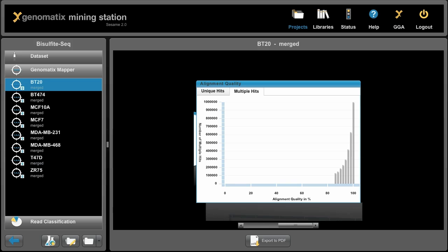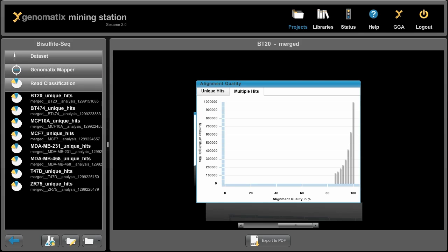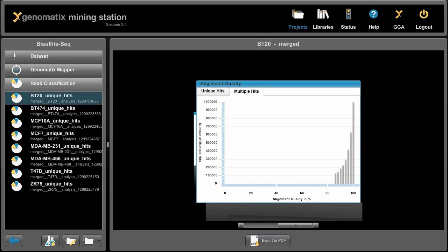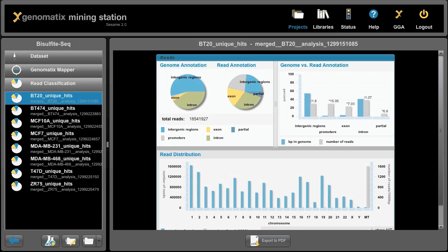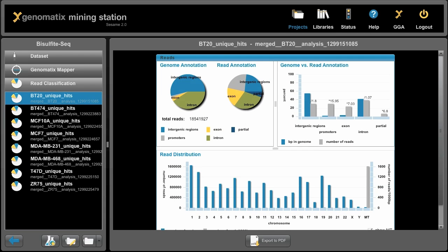We can also do quality control or read classification. For example, we can look at what genomic regions are enriched within the mapped reads. And in this case, exons are enriched and also promoters. And that's not a surprise because a lot of CpG islands overlap with exonic regions, but more importantly with promoters.